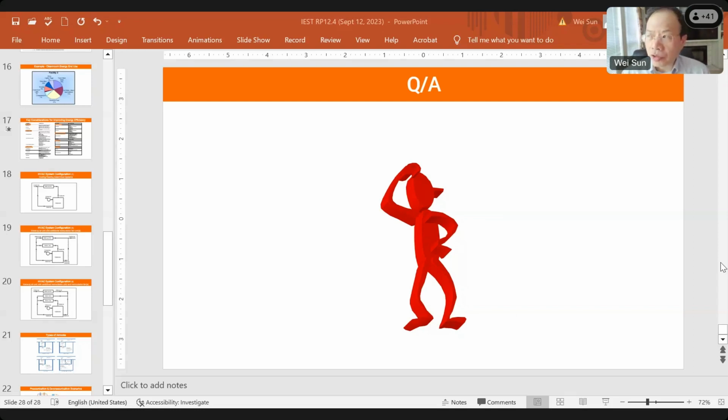Our observation during that time was that as long as the temperature is within a normal range, let's say 65 to 72 degrees Fahrenheit, the impact of temperature variation on the particle counts seems very limited.